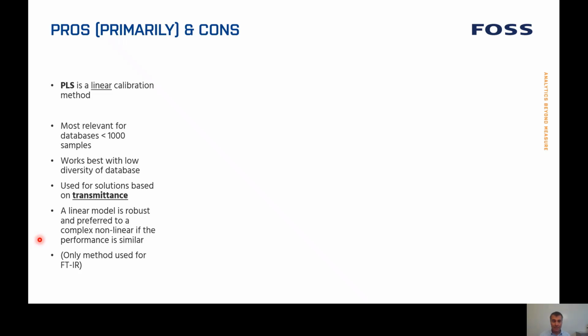And just as a side comment here, on all our FTIR platforms, PLS is the only method that we actually use here.